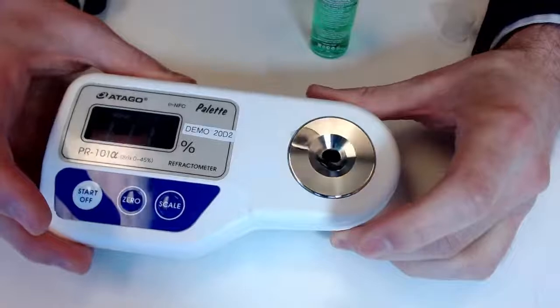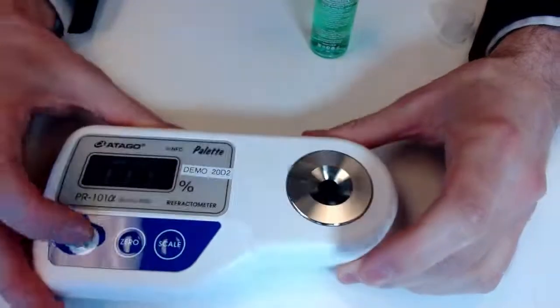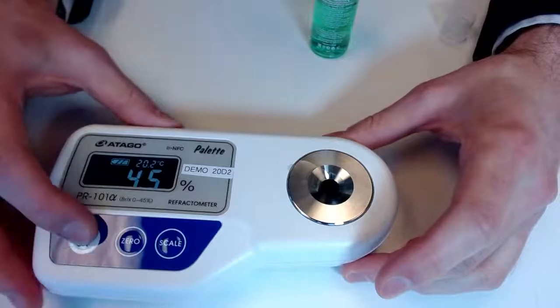So I'm not entirely clean with my application here, but we can see that the prism is covered. Go ahead and hit start. And we're right at 4.5% Brix.